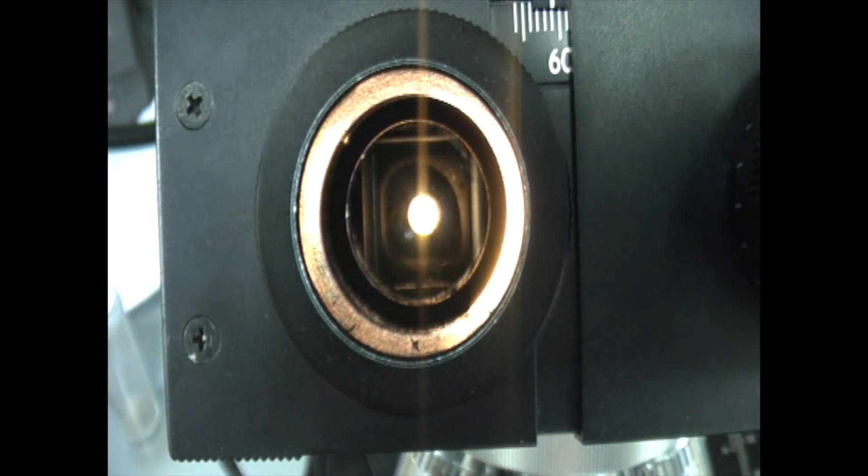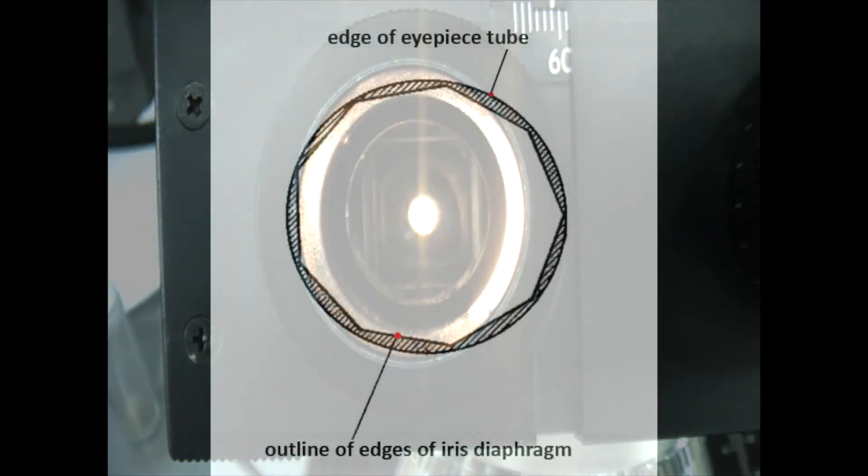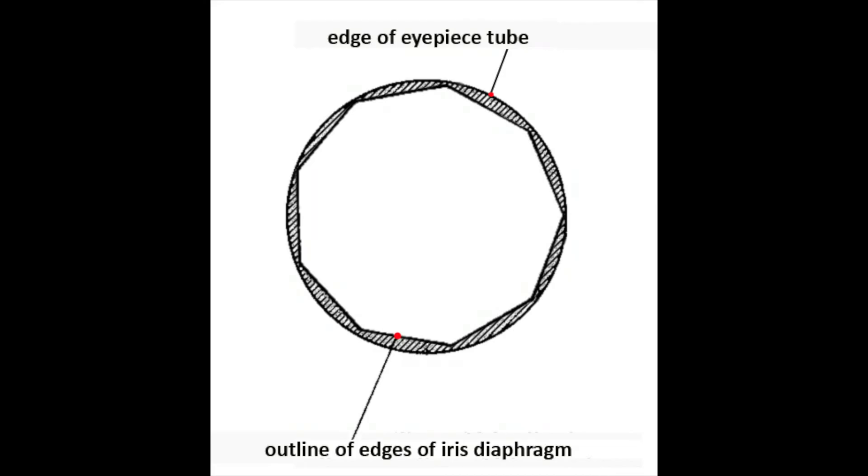The correct position is when the blades just disappear from view, as in this diagram. Practice moving the lever so that you are familiar with the blade movement and choose the correct position, then replace the eyepiece.